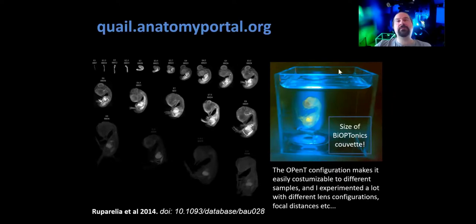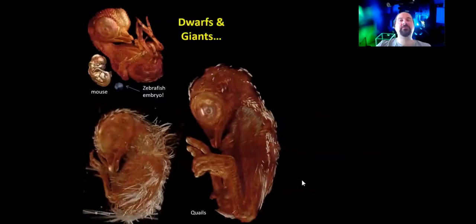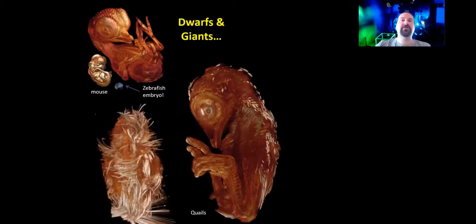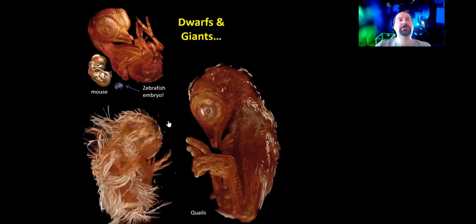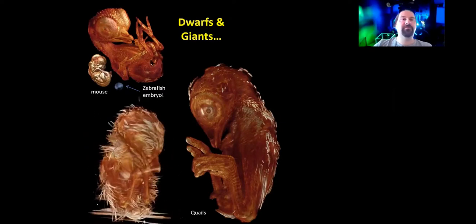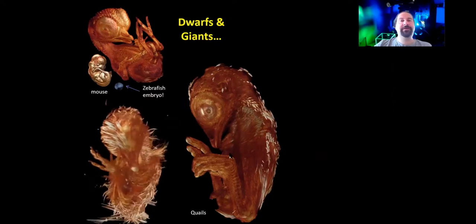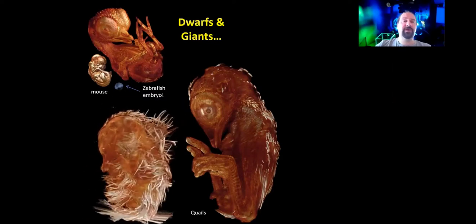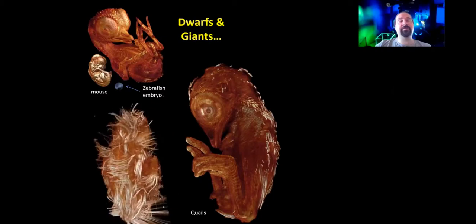And I had built this fairly large cuvette, or acquired this very large cuvette for my scanner, and I was just testing how big a sample I could put in there. So we were actually able to image really very large, all the way up to 4 centimeters long, which is the full term. And now we're really talking, if this is a zebrafish embryo, this is a dwarf compared to these giants.